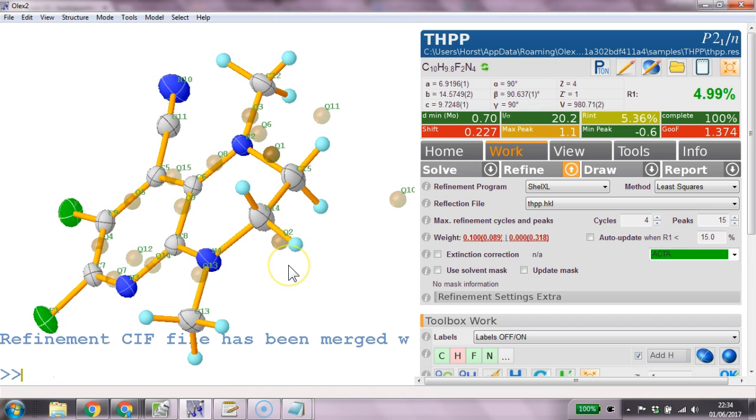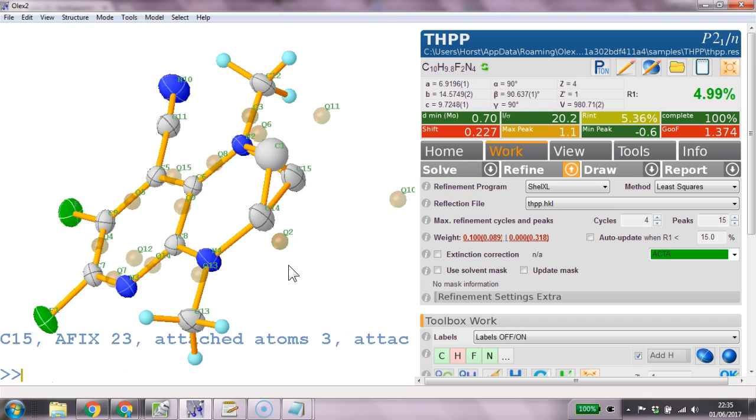Let's do it the other way. Let's go name c 1 n. Sorry. C. So this is making the disorder slightly differently. We go cell c 1 to selected.